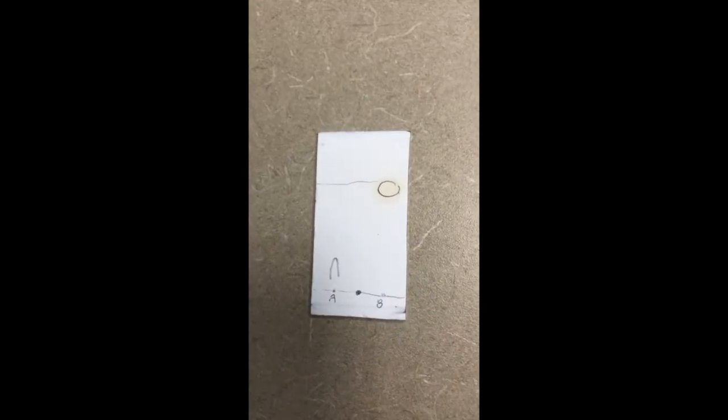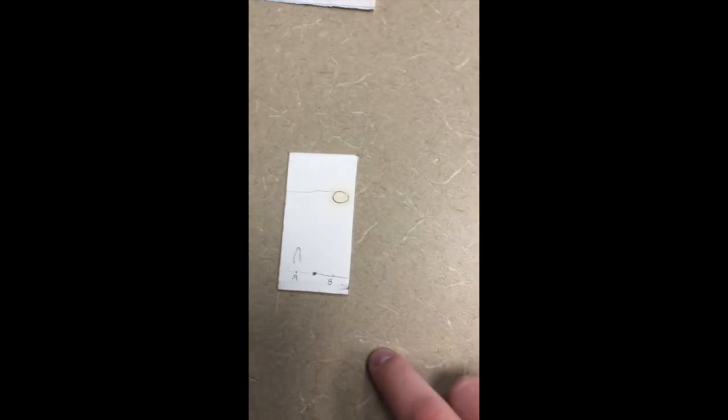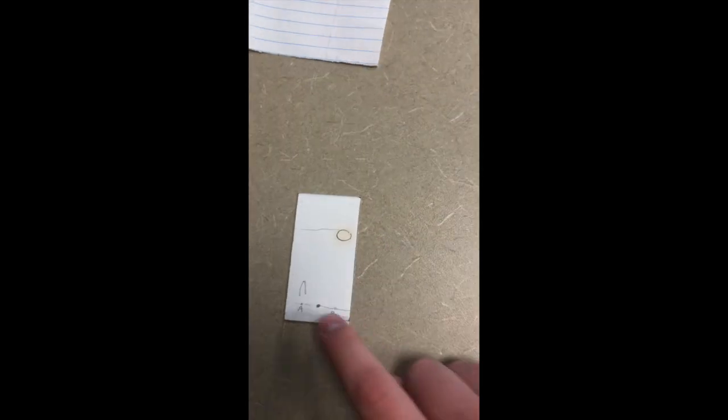After we have gotten both our pure acid crystals and our crude base crystals, we should do a TLC plate with the eluent being diethyl ether to ensure that they are pure compounds and do not contain each other. So here's an example TLC plate where A is our acid and B is our base, and as you can see, they don't contain components of each other.